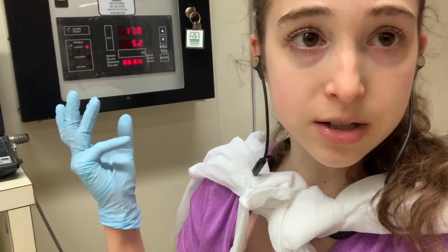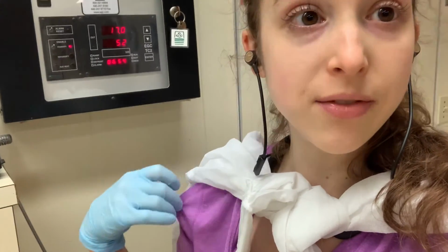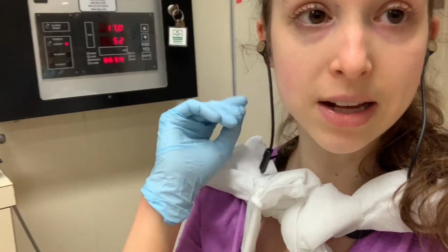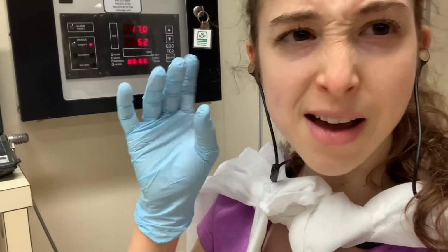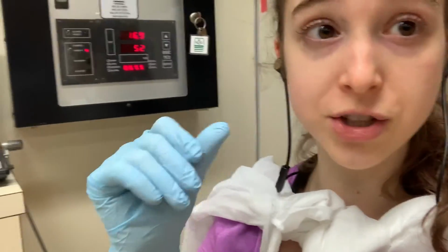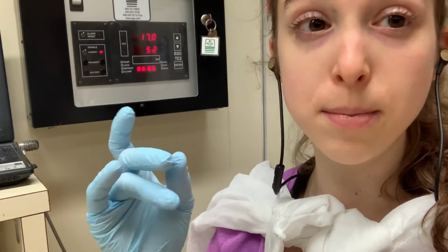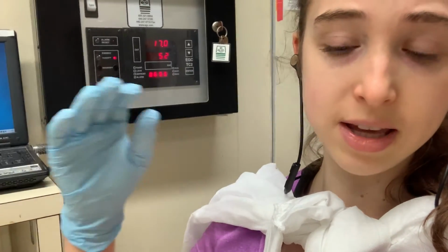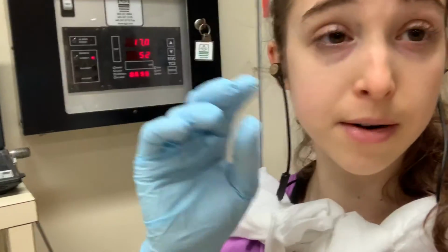DNA or RNA. Or we can use this for other things as well with this thing called Beer's law, where we have an extinction coefficient, which is a measurement of how much a certain molecule will absorb at a certain wavelength. For DNA and RNA, we can calculate rough average values for these, as well as the actual specific extinction coefficients, because they depend in part on how long your nucleic acid is in the sequence, because the different bases will absorb slightly differently. I'll get into all of this later.